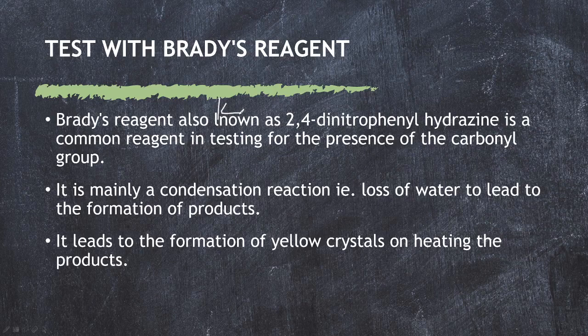It is mainly a condensation reaction, that is, the loss of water. In this reaction, water is lost, and the product combines to lead to the formation of another organic compound, which is called hydrazone.